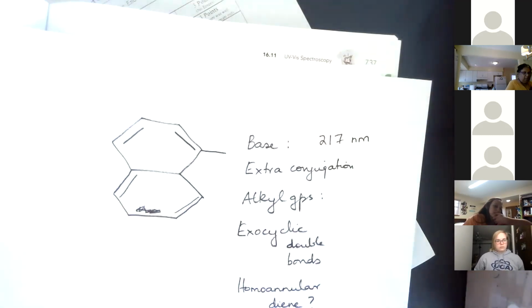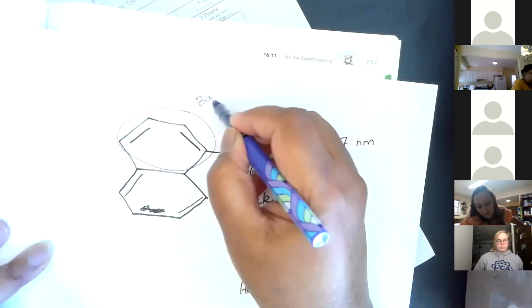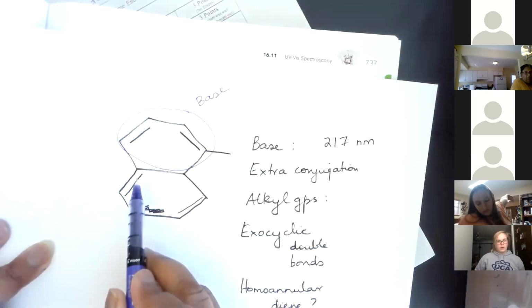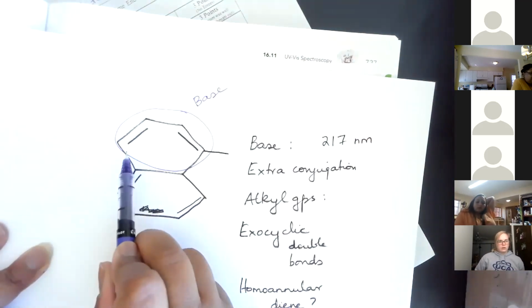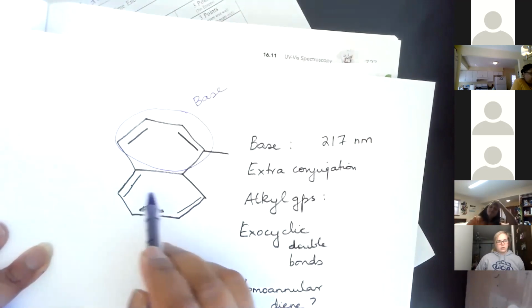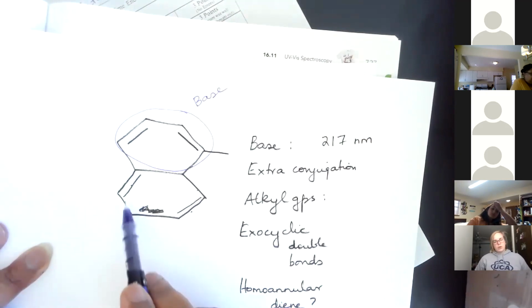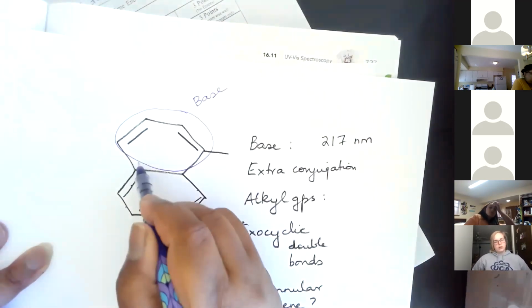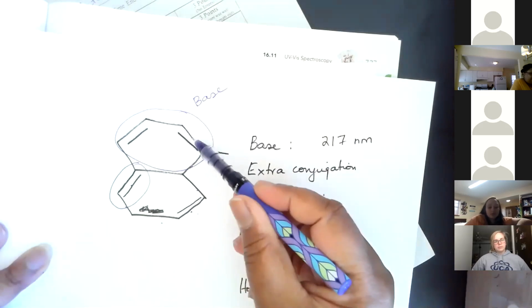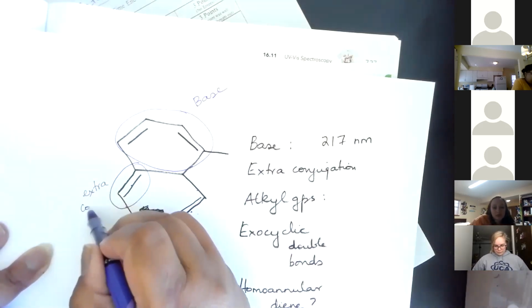Conjugation, you're looking at these two, right? This is your base, right? Now this is conjugated with that, which means single, double. Now here, single, single, double. Here, single, single, double. So the only extra conjugation coming from that is that one.